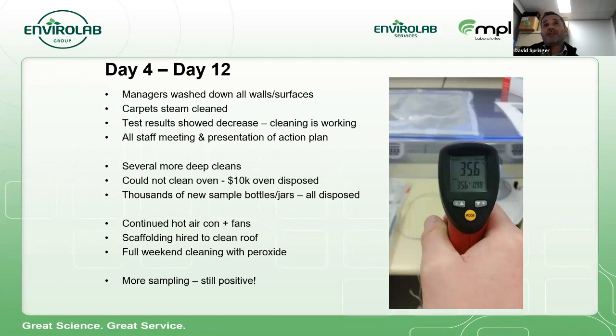So over the next 2 weeks, the managers all suited up and we washed everything. We had the carpets cleaned. We started doing our own testing, and we showed that the cleaning was working. The air testing results were going down. We had an all-staff meeting and presented an action plan to staff of what we were going to do.